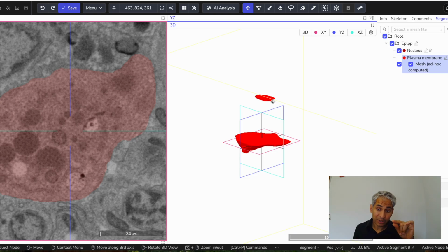Again, it would take maybe an hour of tracing or more, depending on how quick you are and whether you have a nice mouse to work with or you're working on your mouse pad. 10 slices are enough. We'll have more time to follow up on the plasma membrane. But practice distinguishing between 2 sides of the plasma membrane, your cell and the cell next to you. And while you're doing it, keep an eye out. What is the overall structure of my cell? Is it round or is it like long and winding through other cells? That's something you're going to add into your reflection this week.